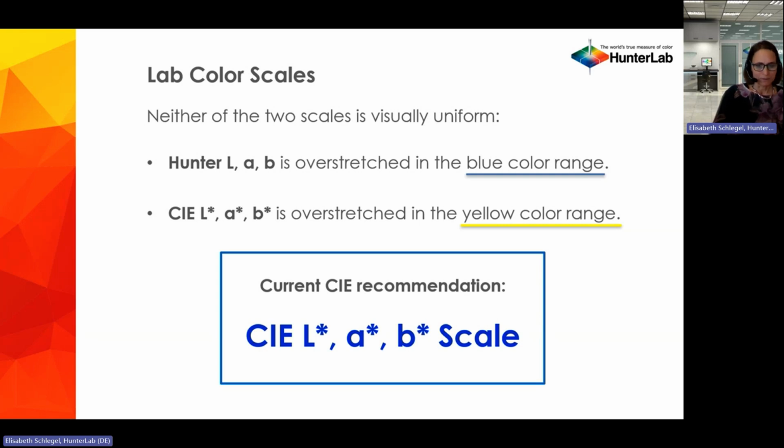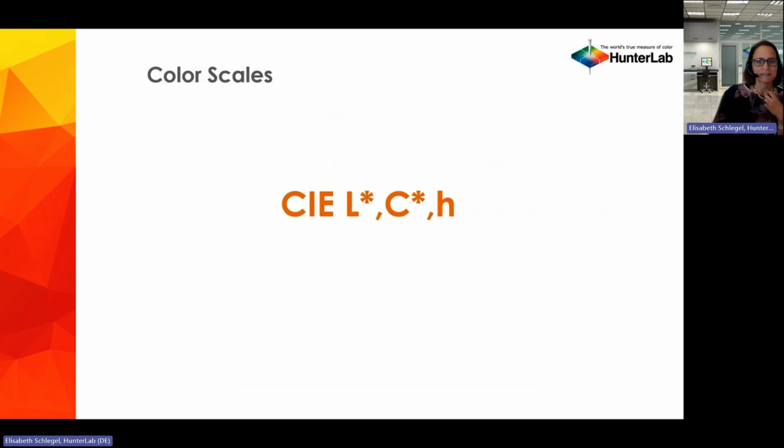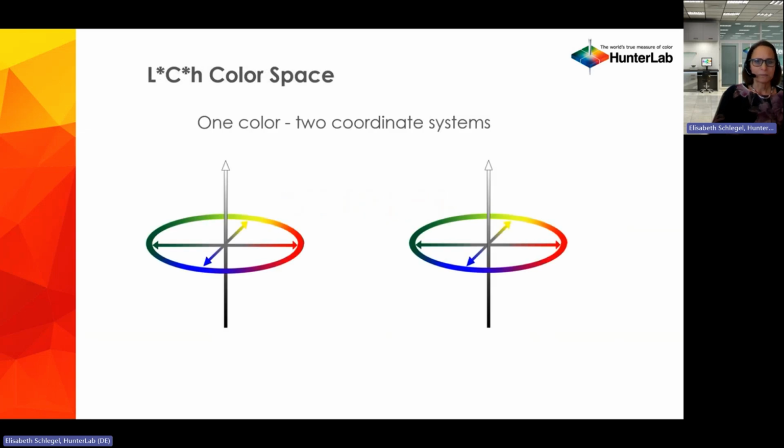Okay, those are these two scales here. And now I come to the third scale. This is the CIE-LCH or L*C*H scale. Actually, that's not really different to the other scales. It's just a different expression of it. We still have the same color space. And I, again, want to define the yellow color of our school bus. So in the LAB scale, I'm doing it by brightness, an A axis and a B axis. So I have these three values, but I can define it differently as well.